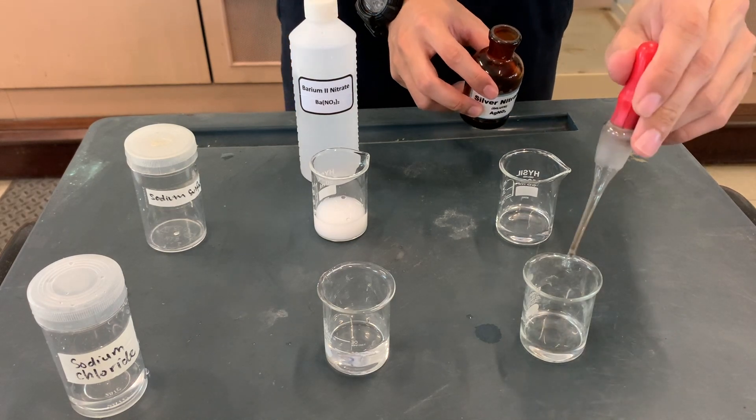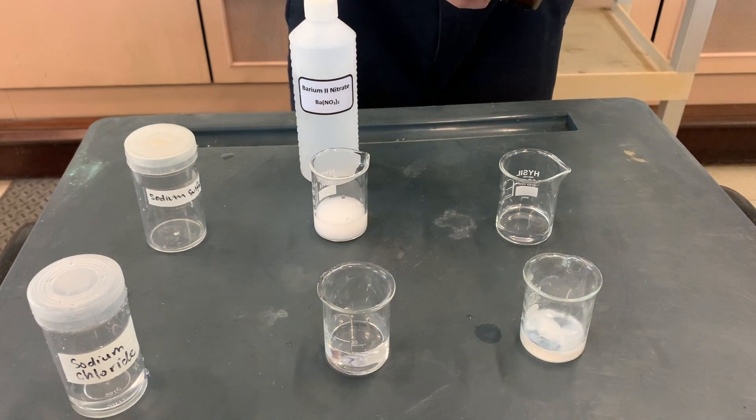And for the last one, when we add silver nitrate to sodium chloride, a white precipitate is seen.